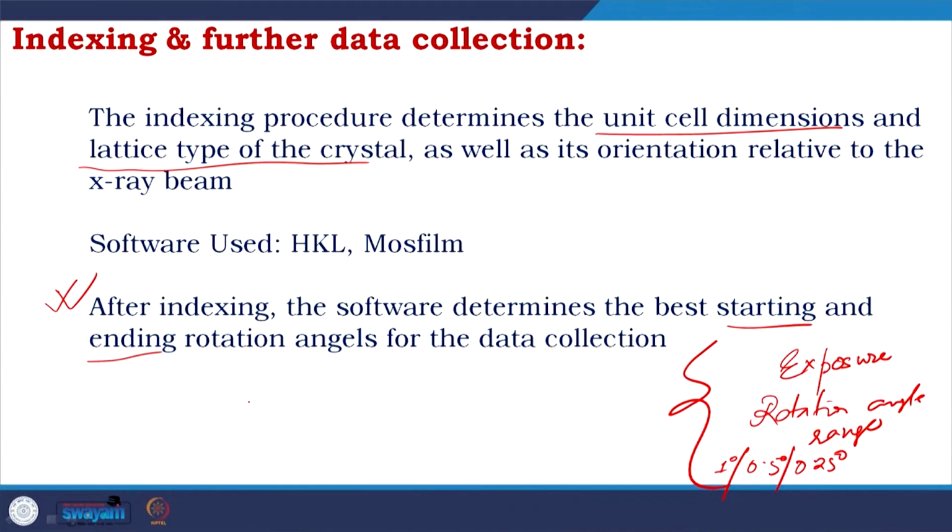Think about exposure, which I already talked about. You put 1 minute or 10 minute, there is around 10 times difference, and you could easily see this is proportional. Then the rotation angle: if you put 90 degree or 180 degree or 360 degree, there would be a 4x difference.